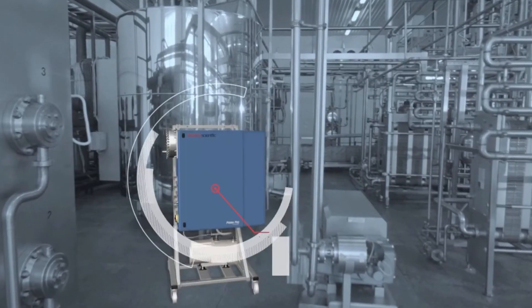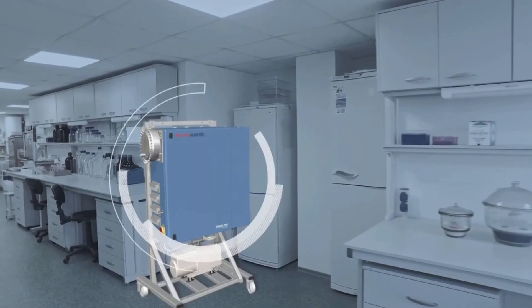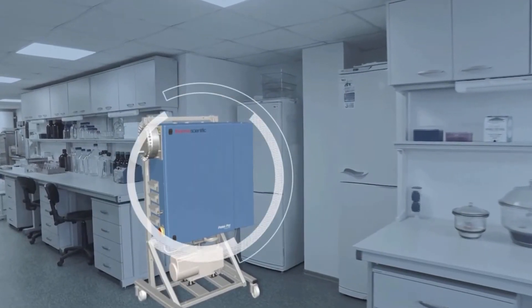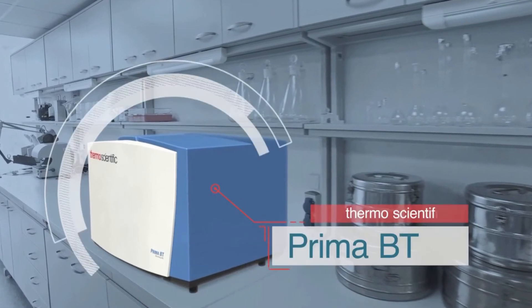The ThermoScientific PrimaPro process mass spectrometer offers fast, accurate, and multi-component analysis which is crucial as flare gas compositions quickly change.